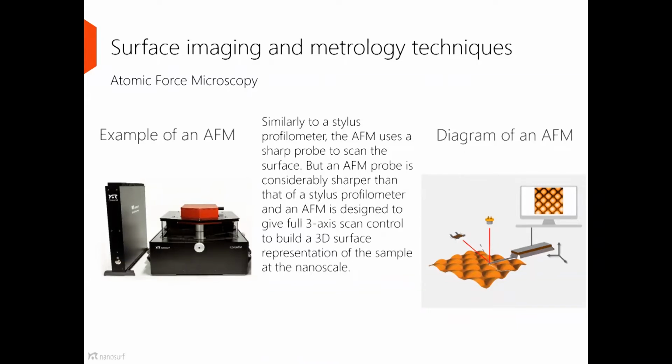And what an AFM really does in practice is, as we move the stylus of the AFM probe across the surface, we're going to be displacing that spot on the center of the detector. And then the feedback mechanism of the AFM is going to move the probe in X, Y, or Z to compensate for that, to try to recenter the spot in the center of our detector. And that's actually going to record the output of the data it used to recenter it as our topographic image.